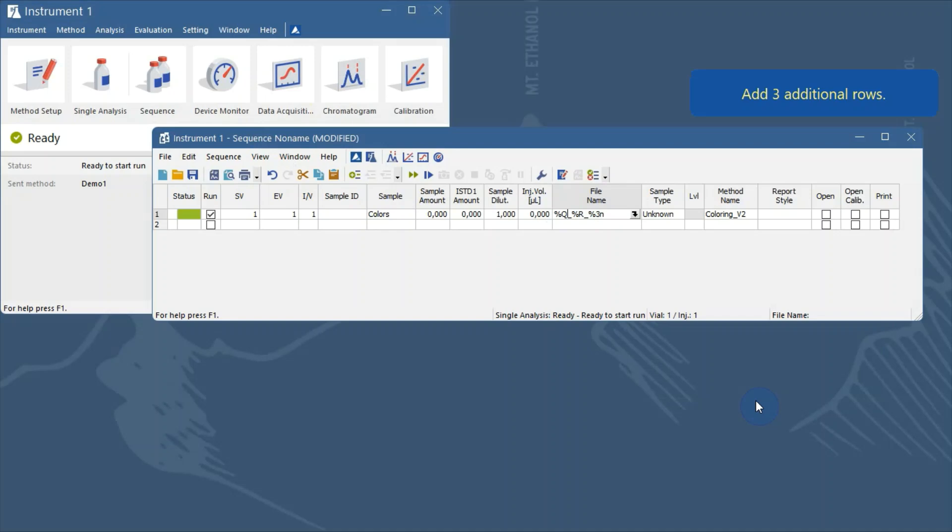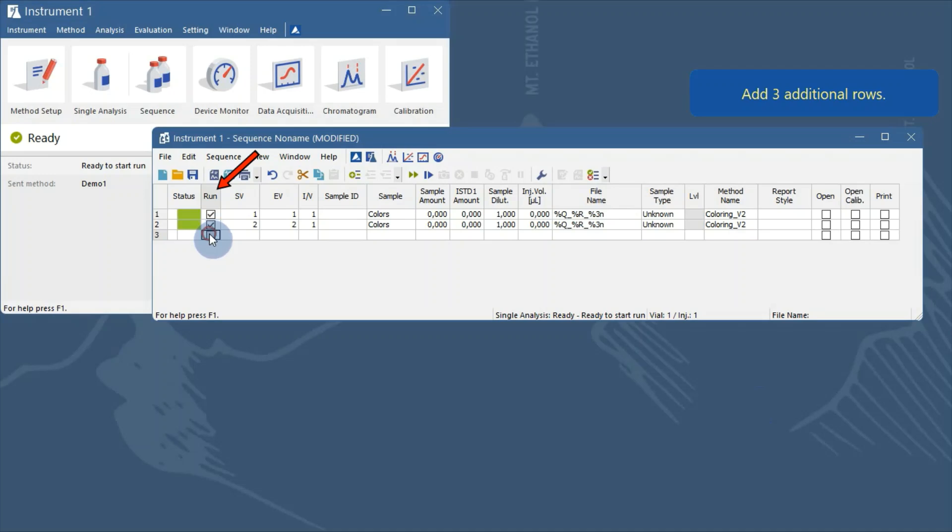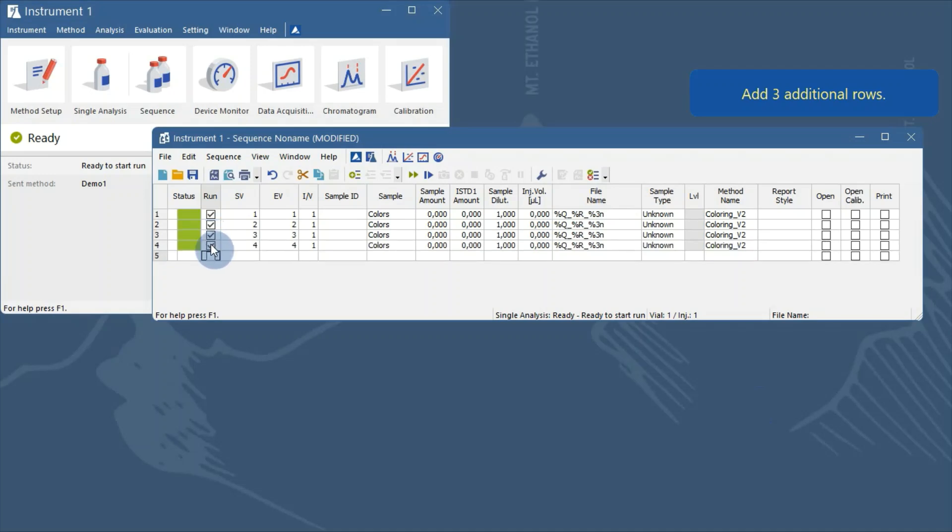Now, we can fill in the next rows. The number of rows you need depends on your specific application. I will check the run check box on another 3 rows. So my sequence will have a total of 4 rows.